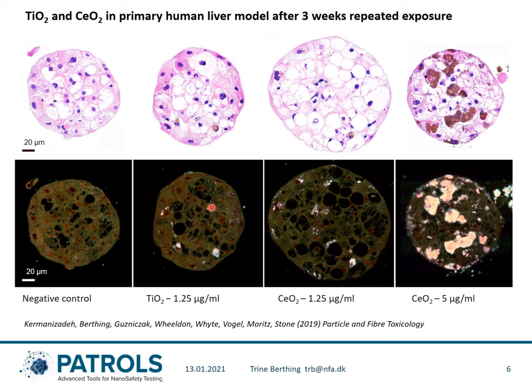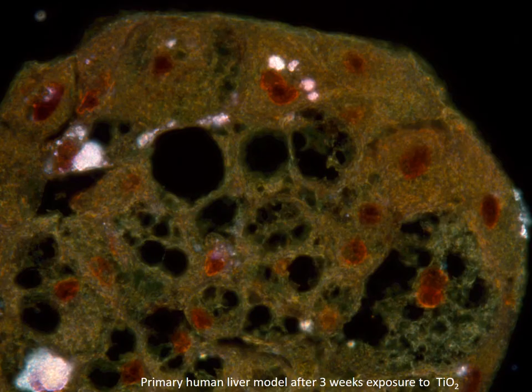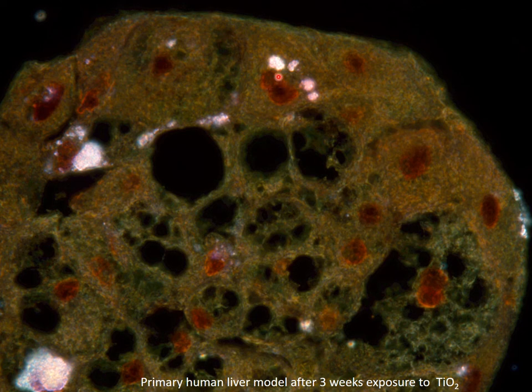When we made thin sections and imaged with enhanced darkfield, you can see that the liver spheroids nicely take up the nanomaterials, so that the cells deep in the spheroids are also interacting with the nanomaterials. Here is a close-up for you to see. For example, here is a cell nucleus — this could be a cell that has taken up quite a lot of nanomaterials. Here you have actually two nuclei and possibly a cell boundary. And out here you can see some nanomaterials still sitting at the external surface of the sphere.